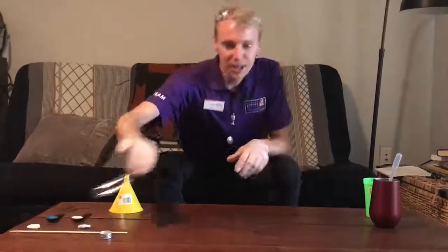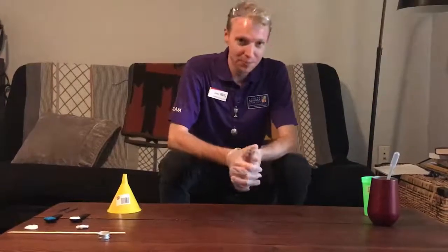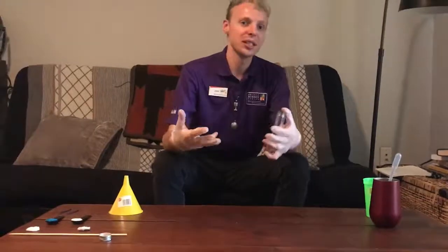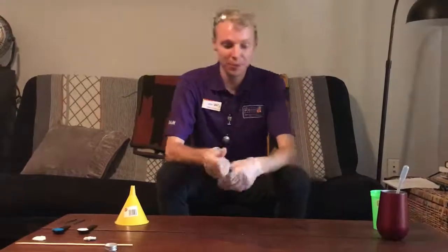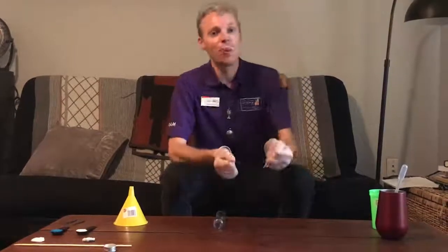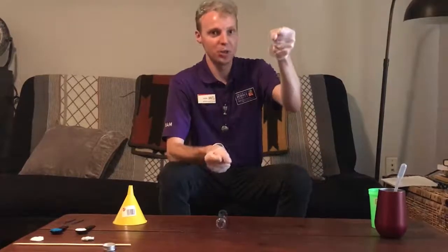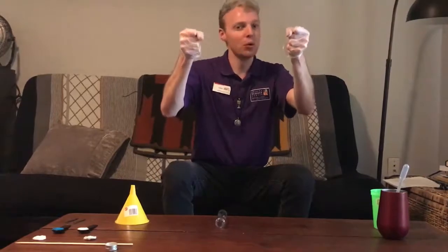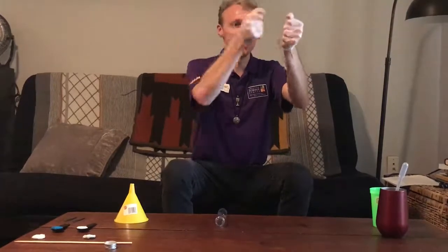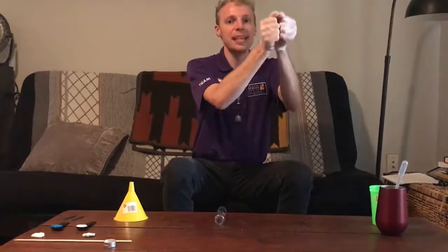So, we are going to be growing our copper crystals using chemistry. When we are talking about chemistry as a science, we're really talking about changes in the states of matter or working with atoms, things like that. An atom is just the really basic founding block of basically everything in the universe. An element is where we start to talk about things on the periodic table. For example, I may have one atom of hydrogen, and then if I add a second atom of hydrogen, I now have two atoms of the same element.